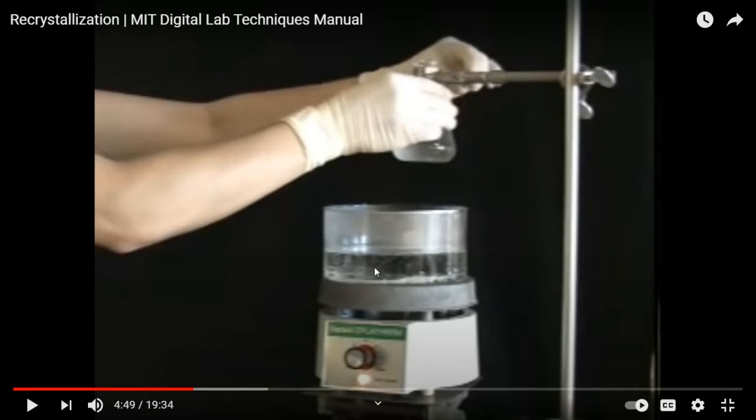Water is going to give a maximum of 100 degrees Celsius. So this solvent will boil, but not as vigorously as if you put it on the hot plate. Also, you have this amount of empty space. So even if some gas escapes and comes down, the empty space slows down the vapors touching the hot plate. And some of them will evaporate into the air rather than flowing down. So much safer. Okay?